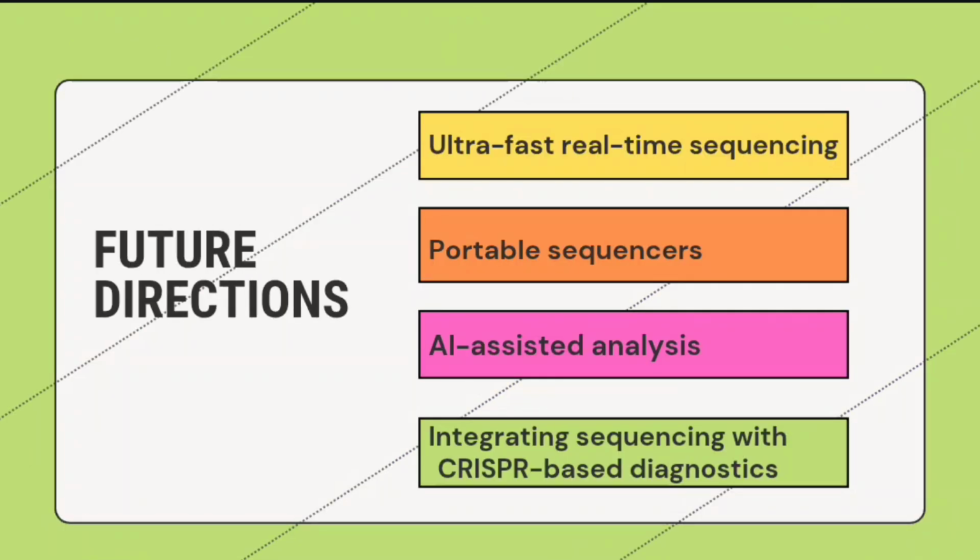future directions. That is, ultra fast real time sequencing for clinical diagnostics, portable sequencers for fieldwork and point of care testing, AI assisted analysis for interpreting massive genomic databases, and integrating sequencing with CRISPR based diagnostics for rapid pathogen detection. So that's all for this video.